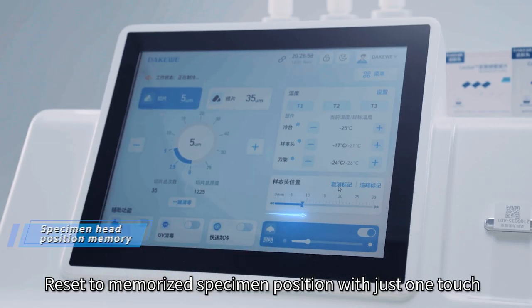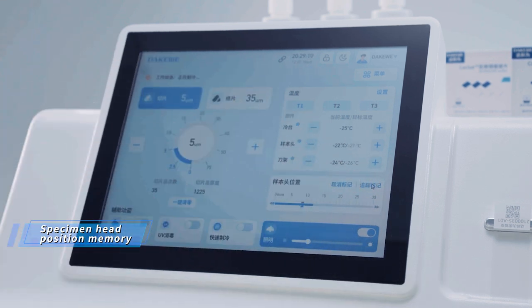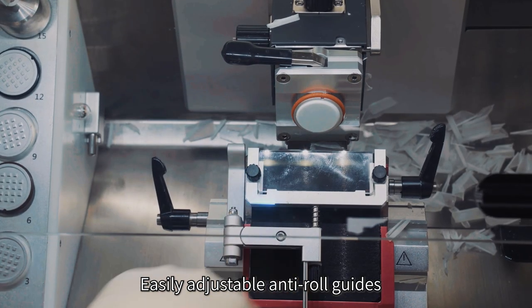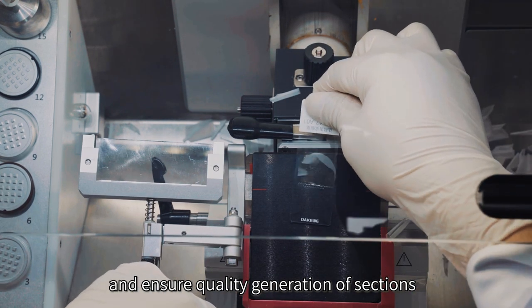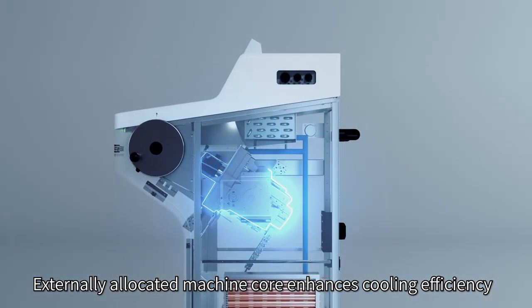Reset to memorize the specimen position with just one touch. Easily adjustable anti-roll guides spread sections, prevent curling, and ensure quality generation of sections. The externally allocated machine core enhances cooling efficiency.